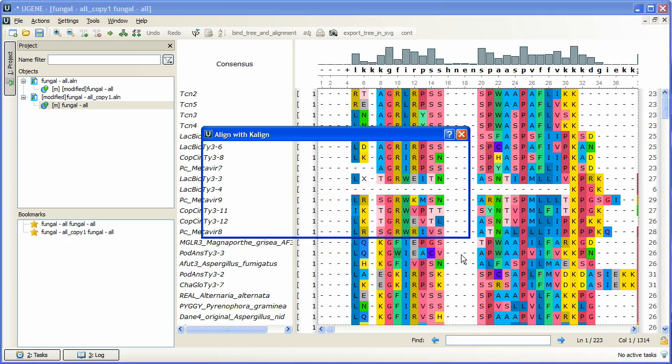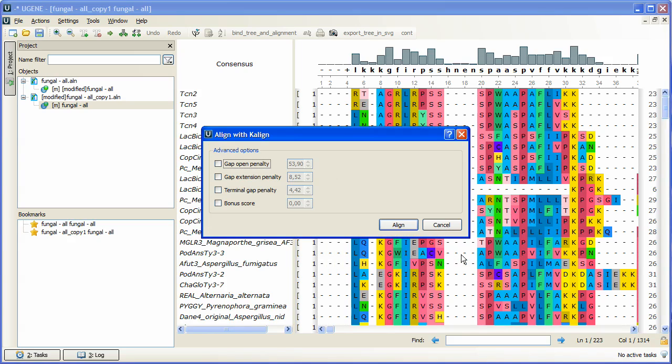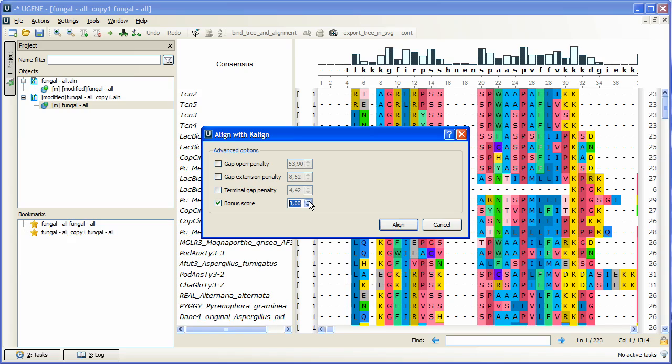There are several options here. We could specify gap opening, closing and extending penalties and edit the bonus score. The more the bonus score value is, the more homologically remote sequences will be aligned. Let's make the alignment with the default settings.